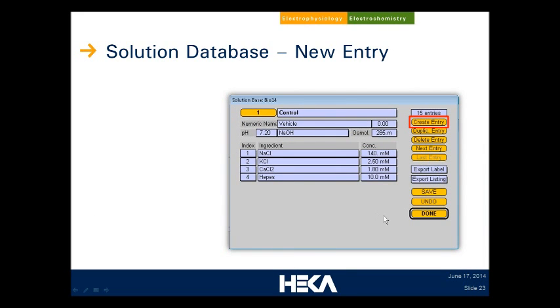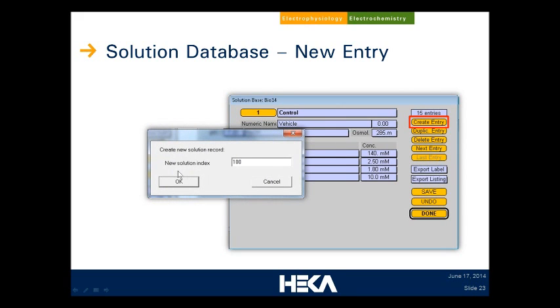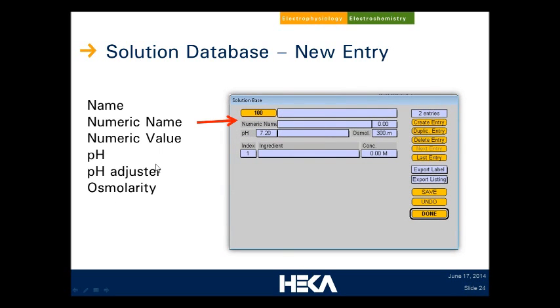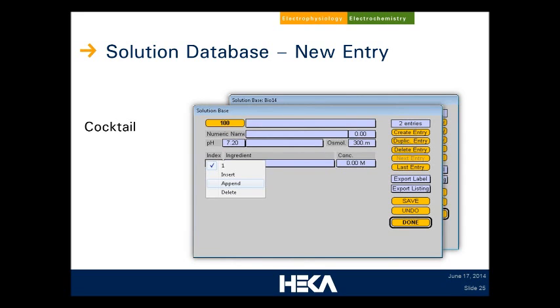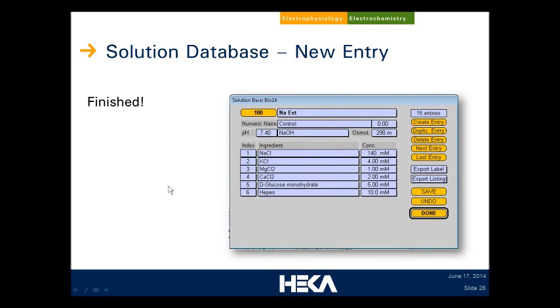To create a new entry, simply click 'create entry.' We give it a solution index — you want to try to keep numbers consistent for similar solutions for easier reference. There is no predefined convention; that's up to you. Then we specify name, value, pH, and so forth. Finally, we go in and insert each ingredient using the commands here to insert, append, or delete an ingredient. Once we have that, we are ready to go.